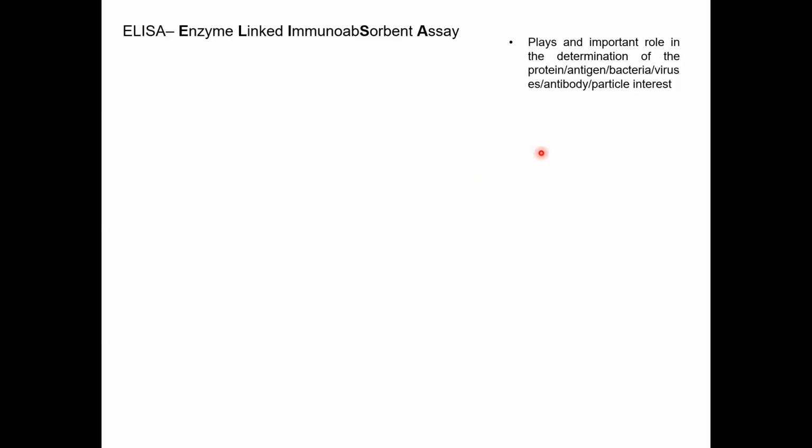The ELISA is a method we use in molecular biology, and also in those labs which make the tests that you pay for, like an antigen test or a pathogen titer, or let's say if you just want to see which kind of STD you had. So the ELISA is a well-used method, and the name comes from the enzyme-linked immunosorbent assay.